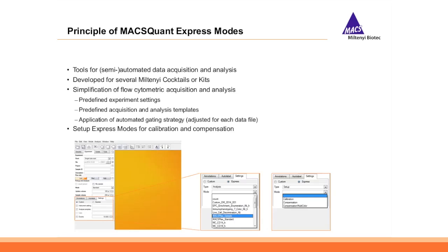You find them under the settings tab, and then you can select the express button and have access to our analysis express modes, where you also find our MACSPlex express modes, and you can also select our setup express modes, for example, calibration or compensation multicolor. So you see, when you use our express modes, already 2 of our 3 requirements are fulfilled. You have the analysis template and you have the gating strategy.